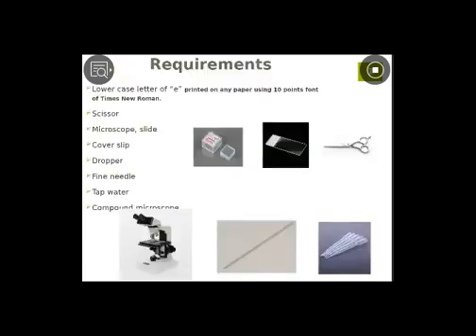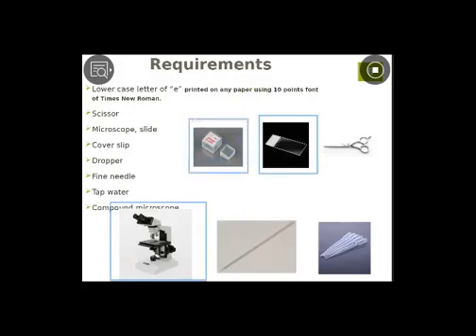In this experiment, look at the ihtiyajat. You look at the requirements: microscope, glass slide, cover slip, scissor, qus, scissor, needle, and qatara, dropper. These are the objects that we need to perform our experiment.